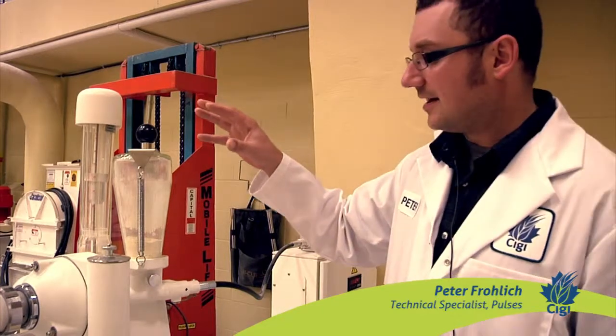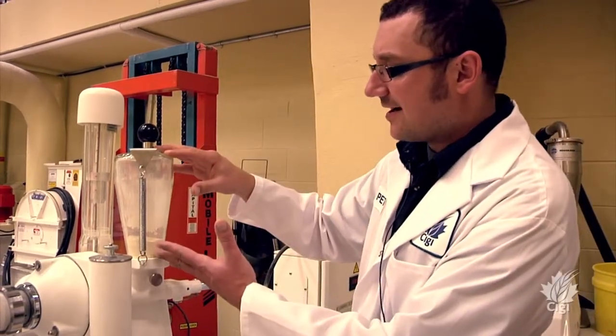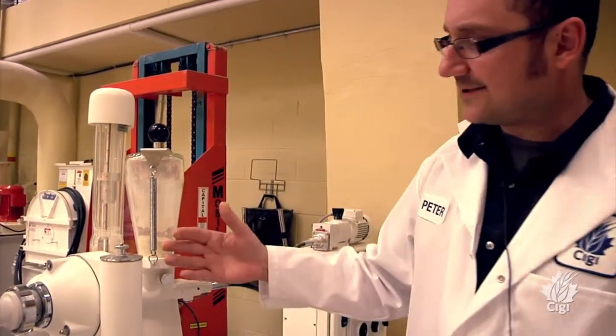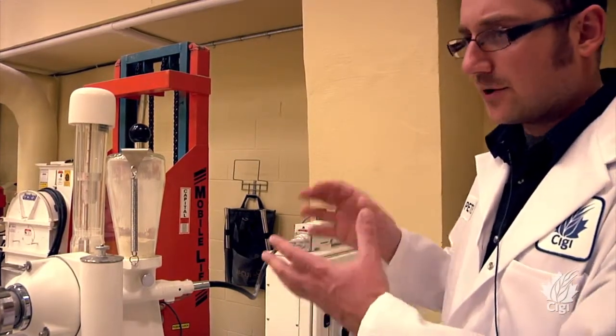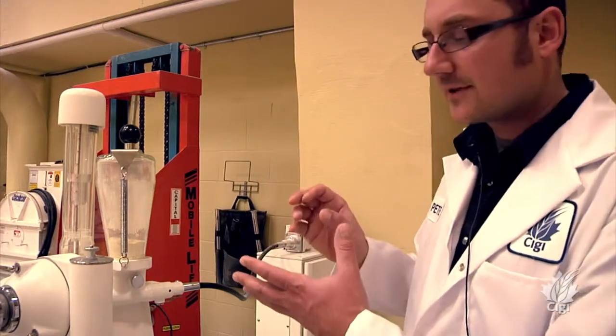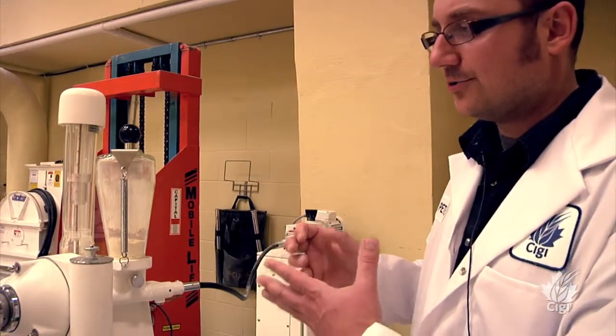What I can do is take this flour, put it through the system, and separate a coarse fraction and a fine fraction. The coarse fraction will be the starch, and then the fine fraction will be the protein.